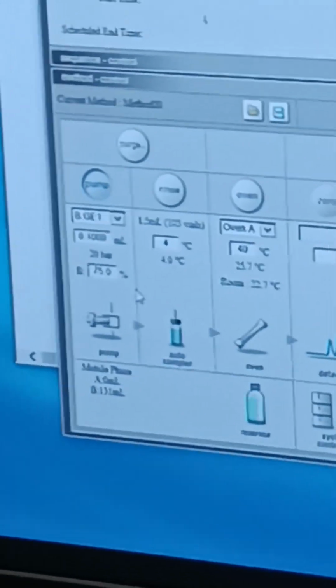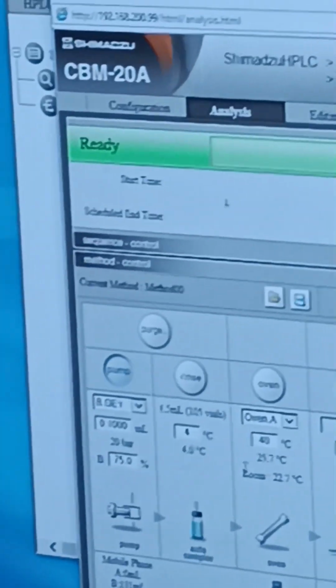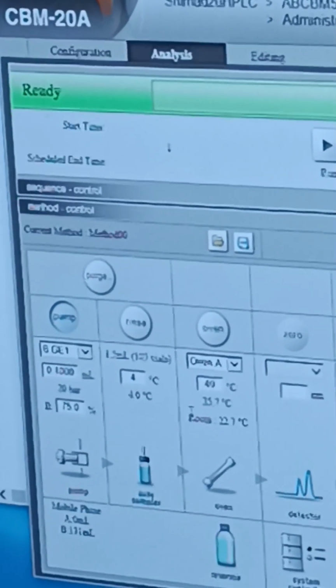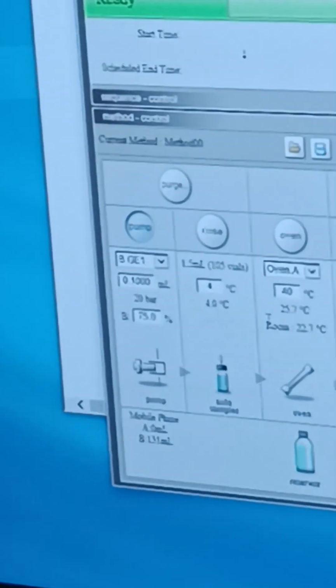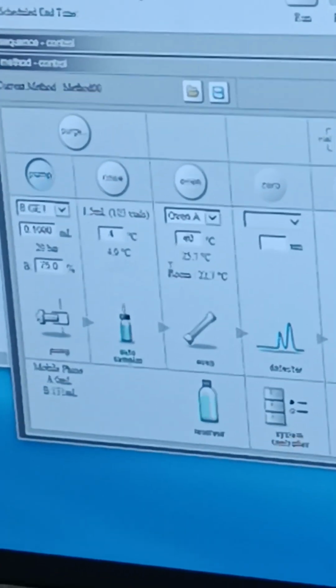So throughout these different intervals, you have to be familiarized with the pressure bar here, to make sure that everything works well. If there's about one or 2 bar differences, I think it's still acceptable. But if anything more than 5 bar, then you might need to be careful. It's either the LC or the column again.